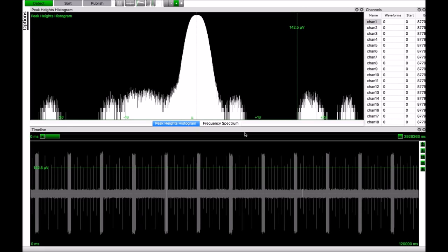So when you first launch BOSS, you'll be presented with a screen like this. And before we jump into using BOSS, I just want to give you a tour of some of the features that Keon talked about earlier and demonstrate how we can manipulate some of these windows to fit our workspace to be how we like it.